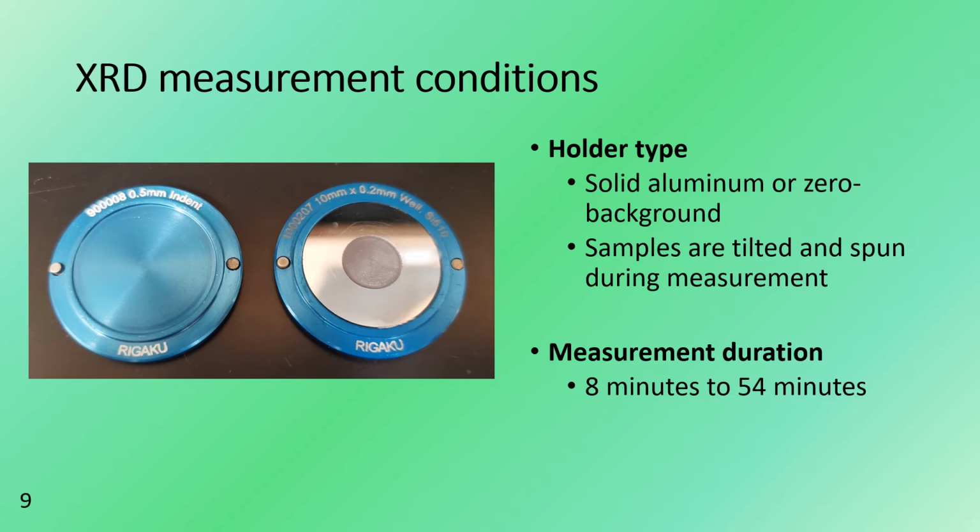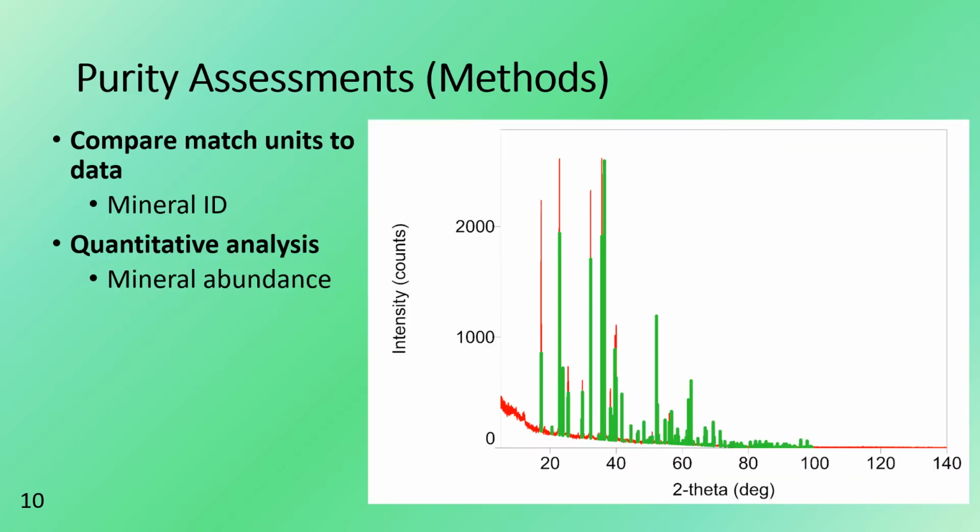And then for measurement duration, we have 3 different durations ranging from just 8 minutes to 54 minutes for one sample. And then getting into purity assessments now, I compared my data to match units.